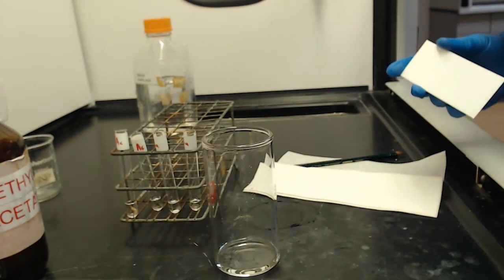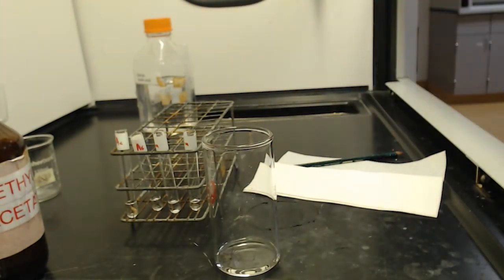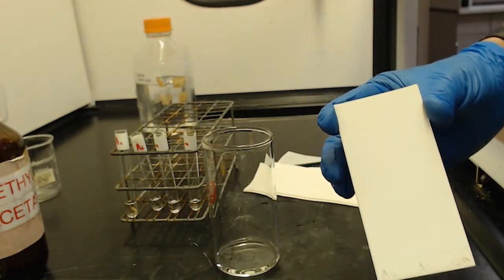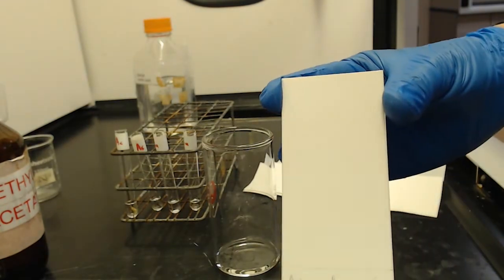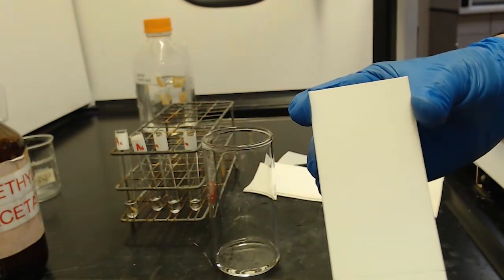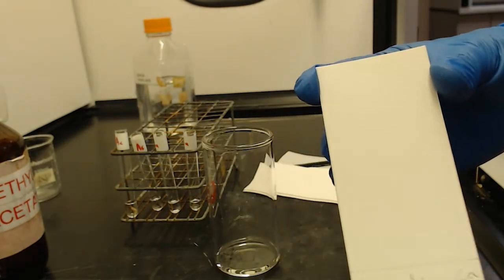For the next part, all you do is set the plate in there and let it run. When it runs up the plate, after you pull it out, you need to make sure that you draw a line to where the solvent went up to. Some people like to pre-mark this and let it run to where the mark is. I don't recommend that because it's a little more restrictive that way.